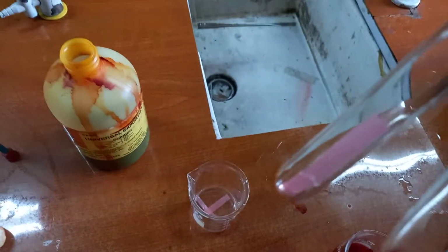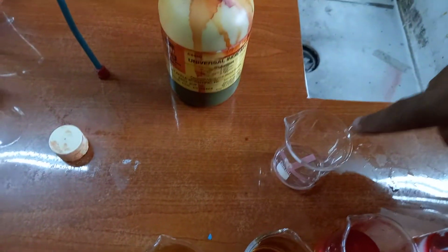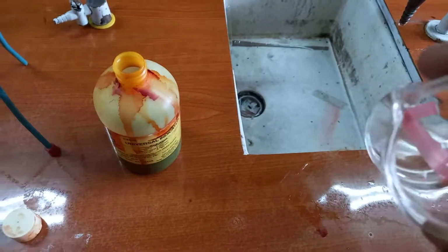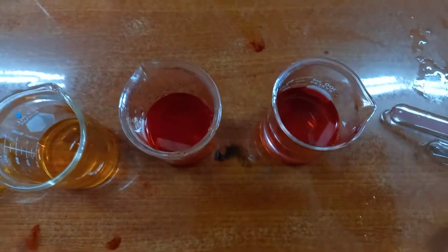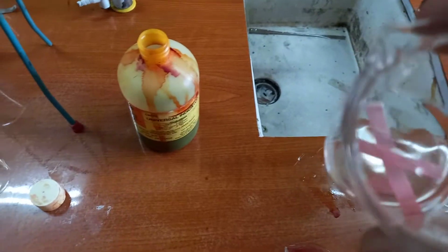Remember we had the aldehydes in these 2 test tubes, so I had poured them out in this beaker. Again, I add the blue litmus paper to show that it changes it to red. Now we know that both the aldehyde and the carboxylic acid change it to red.